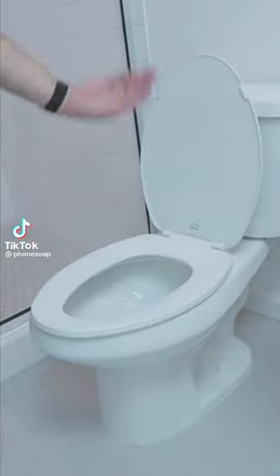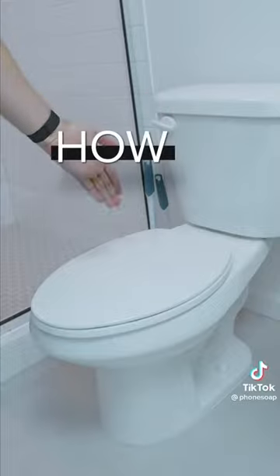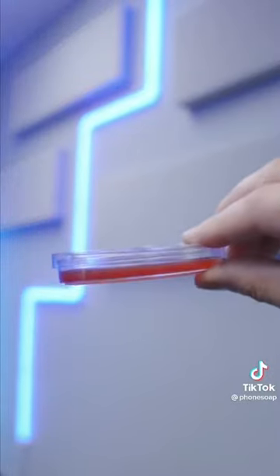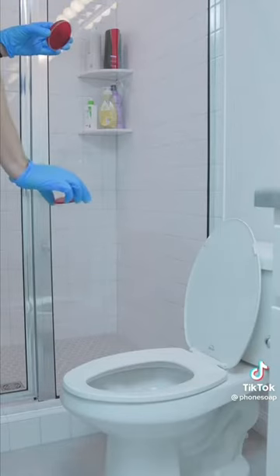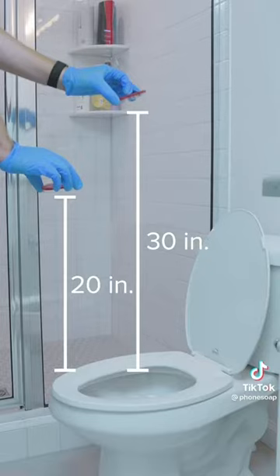So when you flush the toilet, do you have the lid open or do you have the lid closed? Today we're going to find out how germy each option is. I will be capturing these tests with a blood agar plate, placing one at counter height at about 20 inches and one at 30 inches.